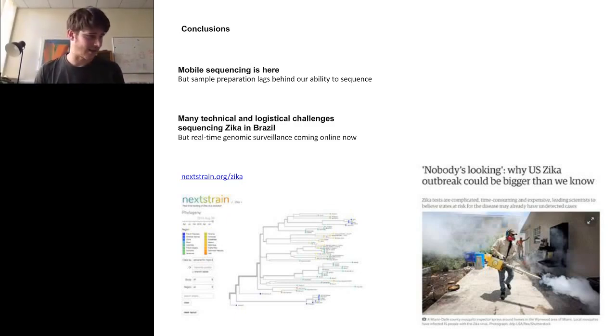So there's an application area called metagenomics, which basically means all of the genomes in a particular sample, all the nucleic acid in a particular sample. And what we would do is take all the RNA or DNA in a sample and sequence it en masse and try to identify what we thought, using databases of existing known viruses, was in that sample.